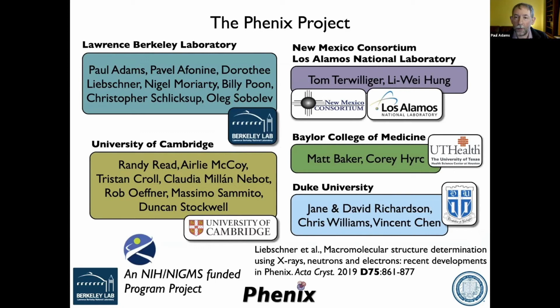So as a first approximation for you to keep going, yes, you can use F model. You calculate your map from F model. Don't forget to set up the table to electron. That's okay as an approximation, but it can be more accurate, and this is something we are working on to make better.